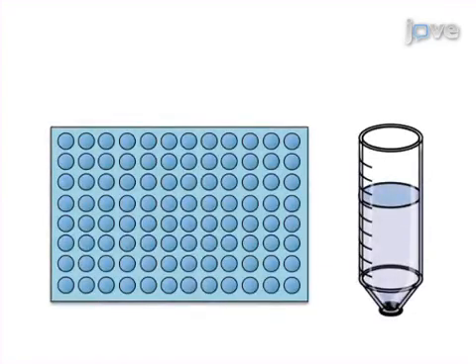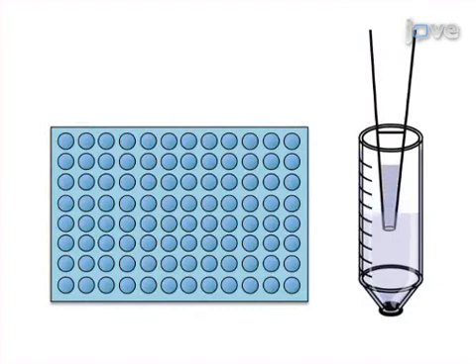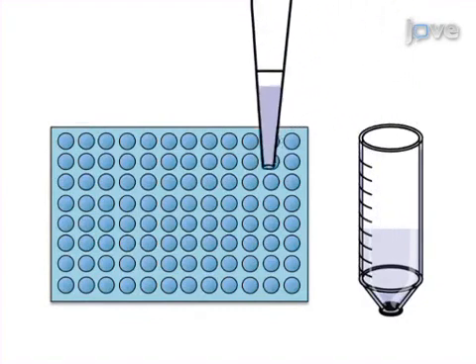As a second step, cells are stimulated with IgE/antigen or a calcium ionophore in the presence or absence of Triclosan, which will cause the release of the mast cell degranulation marker β-hexosaminidase into the supernatant.